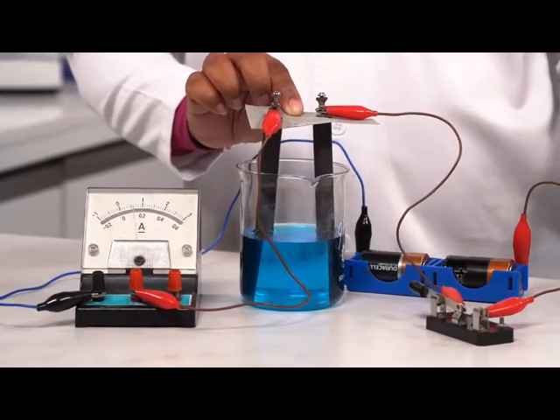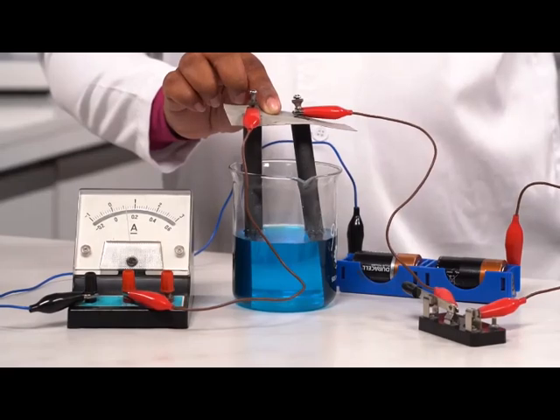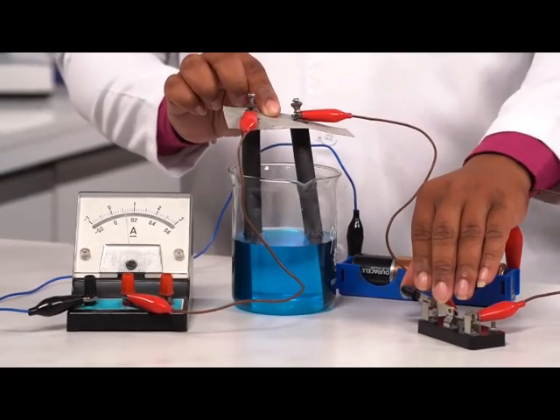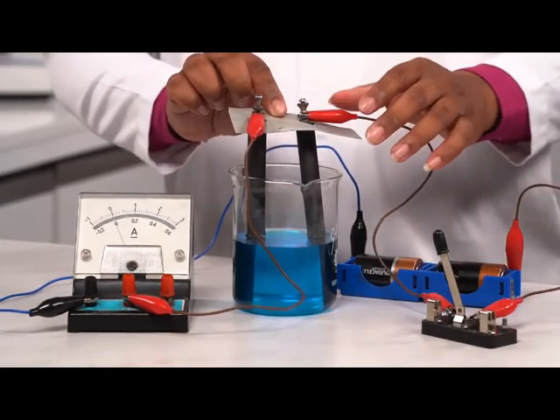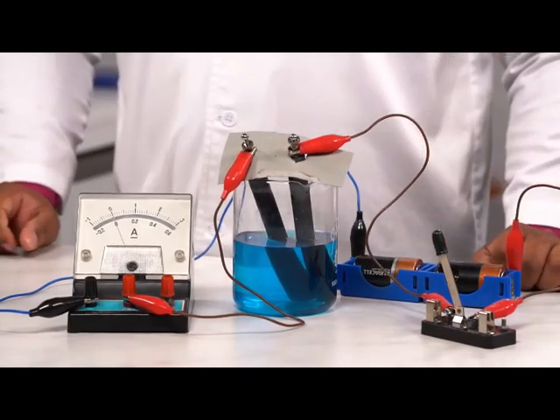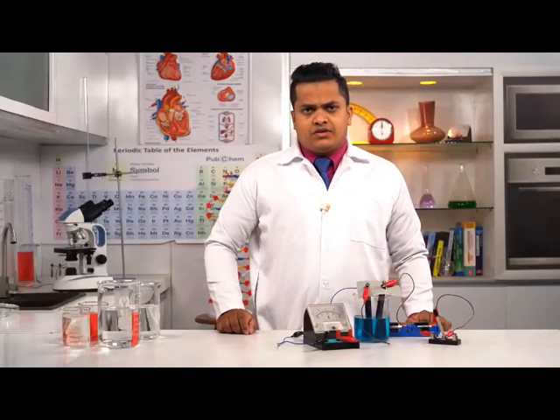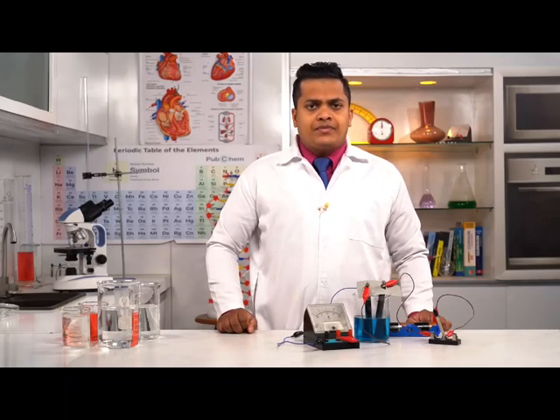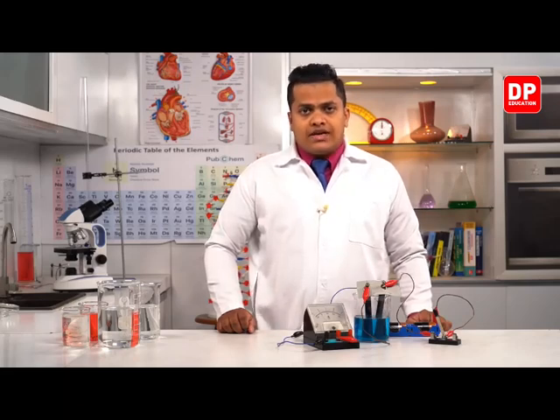So it's very obvious to us that this copper sulfate solution is going to conduct electricity. That's why the ammeter reading is going to show a certain value. Right, my dear children. So by conducting this activity, we can observe that there are some solutions that can conduct electricity and some solutions that do not conduct electricity. So let's head on to the classroom once again and we'll identify these two solutions. And once again, we'll write down our observations and conclusions from the activity.